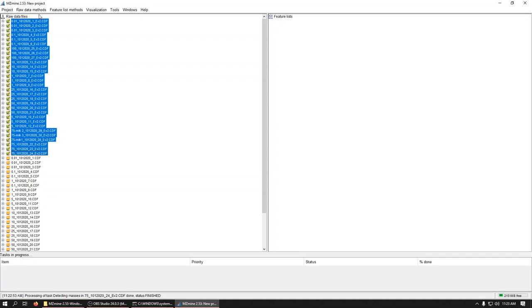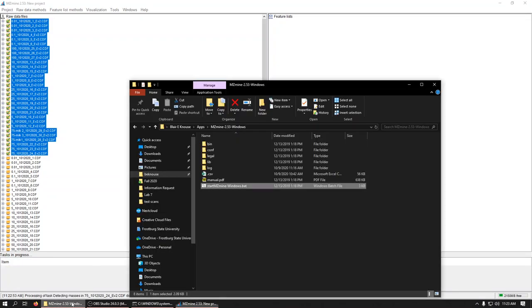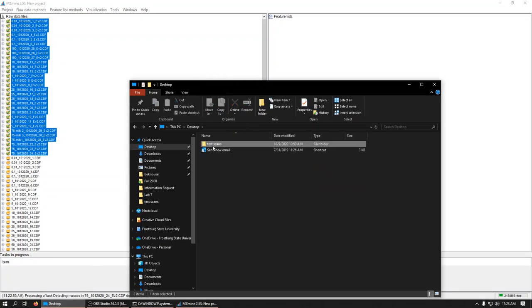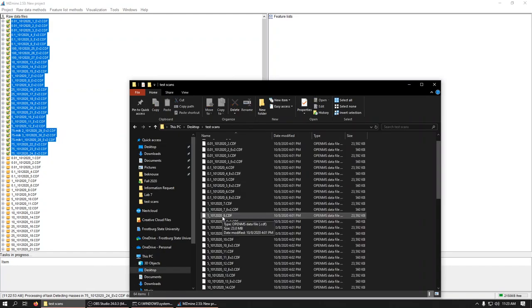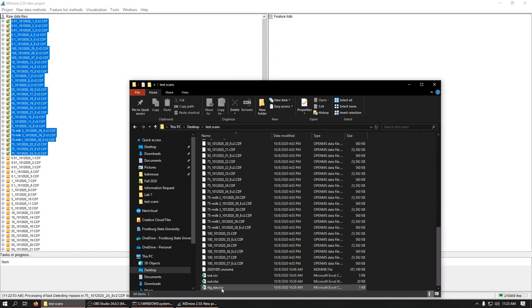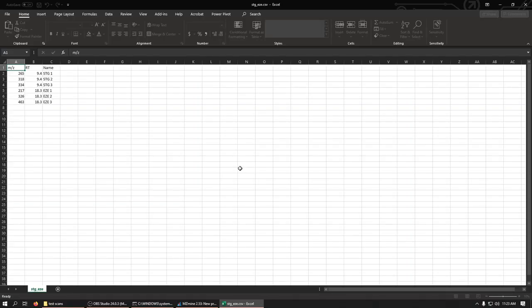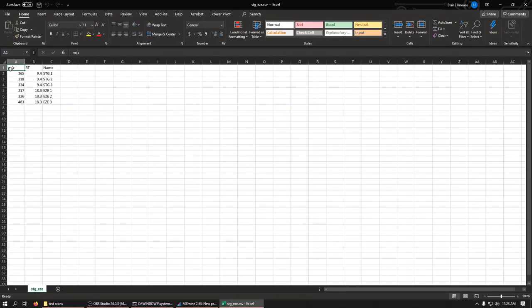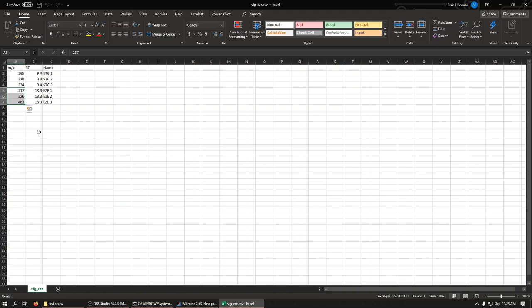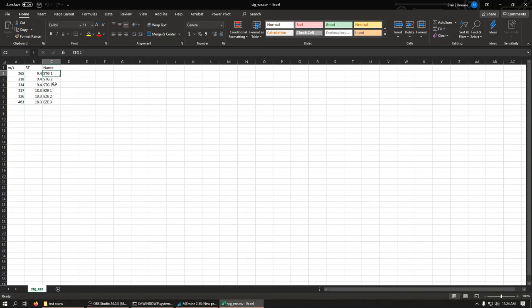We already figured out which peak areas we want to use in Shimadzu. So I've created an Excel file. And actually it's saved as a CSV. Wait for Excel. And it needs three things. It needs the mass to charge ratio. So here are the three masses for our analyte. Here are the three masses for our internal standard. The approximate retention time for each of them. And that's in minutes. And then you can name each peak. And so I've just abbreviated STG 1, 2, and 3 for sitagliptin. And EZE 1, 2, 3 for ezetimibe.